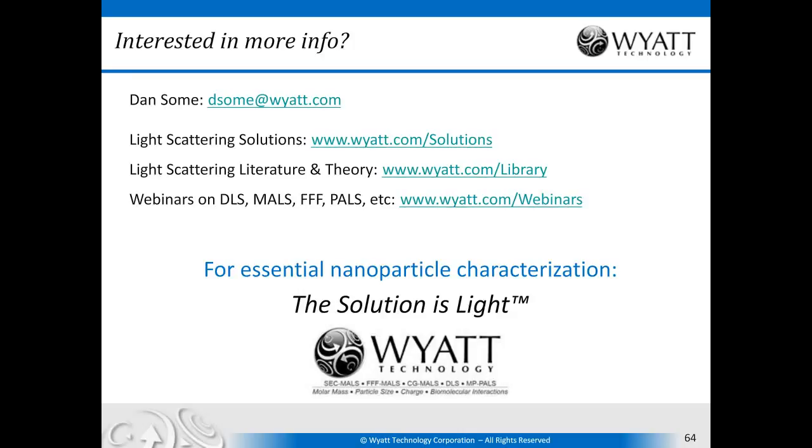My nanoDDS system is biodegradable. How can I characterize the degradation rate? Yeah, so a good way to do that is to utilize the CG-MALS system. One of your solutions would be your sample, and the other would be a reagent which causes the degradation, something that creates an environment similar to the physiological environment, or some other bioenvironment which leads to degradation. Once the stop flow is affected, you've combined the two solutions, injected them into the light scattering detectors, and the flow stops.